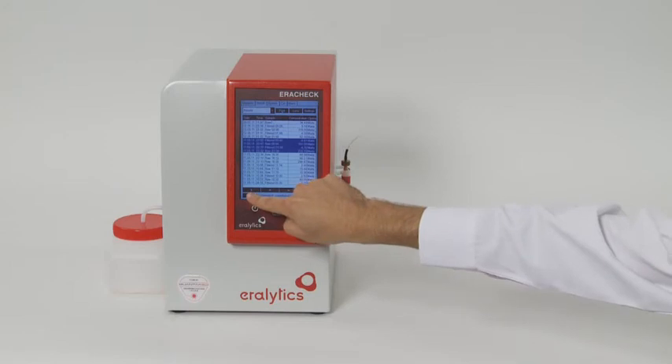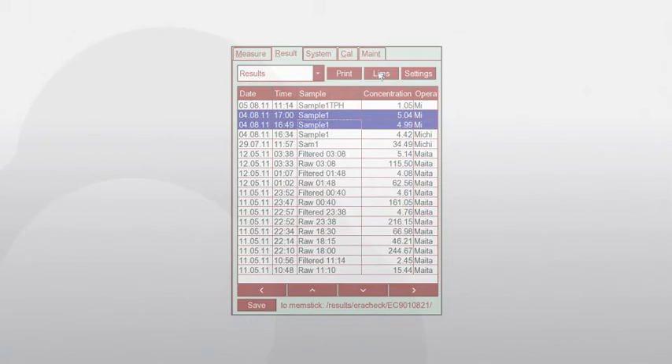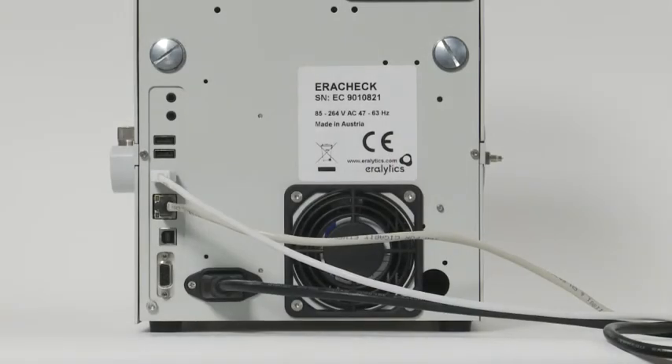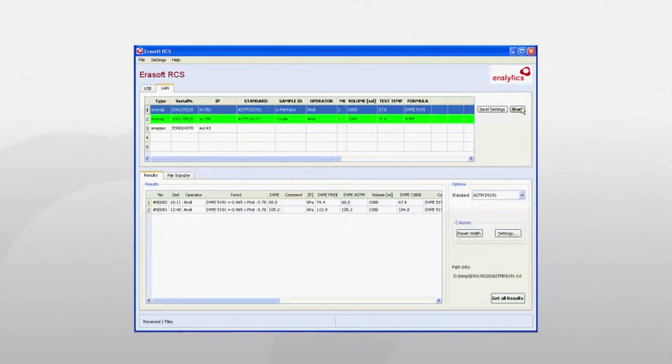A file containing all results can be stored on a USB flash drive for storage on a PC or review in MS Excel. A very convenient alternative is the automatic transfer of data to a LIMS system — no software is required; just connect the instrument to the local area network via the built-in Ethernet connection and define the folder and file name where results shall be stored.